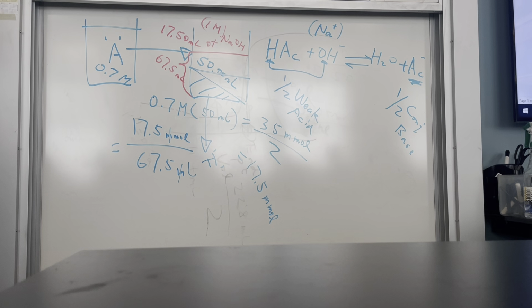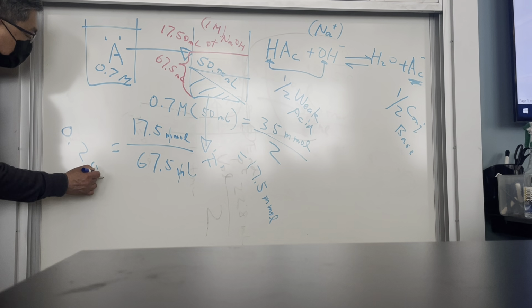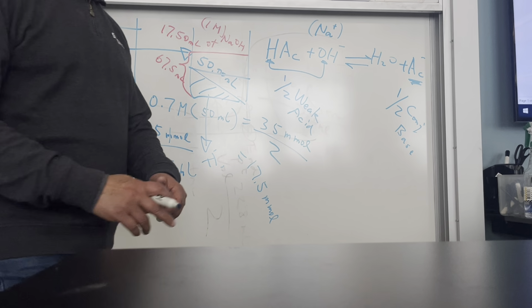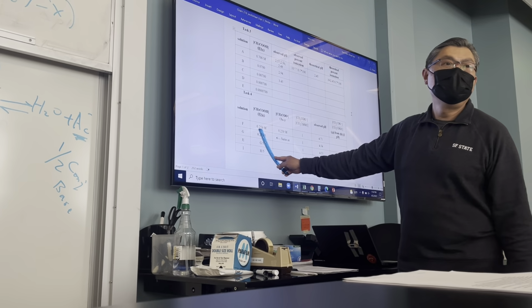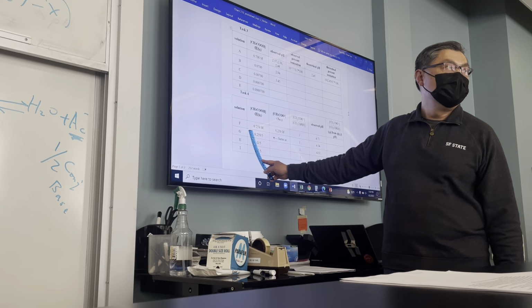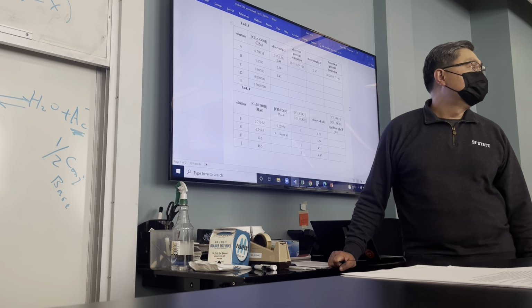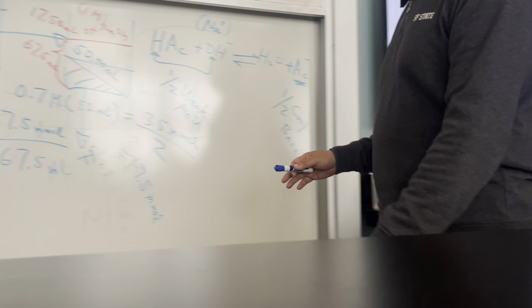What's the concentration? 0.259. I wrote it down for you. Now, that is solution F.